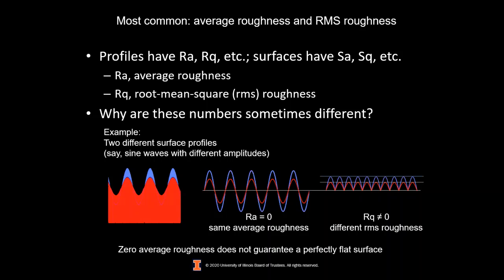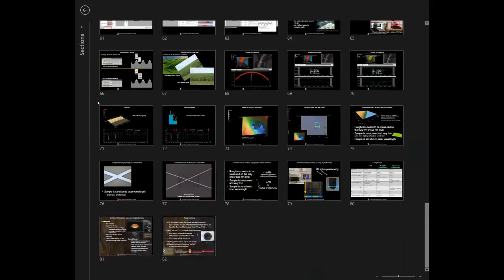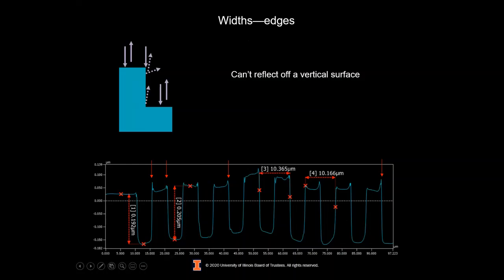Okay. This question seemed interesting and followed along. Is it also possible to measure samples with high aspect ratios, such as a nanowire array or a pillar structure? Yes, as long as you don't care about the sides too much. You can definitely measure the heights, and I'll get back to this image here. You can definitely measure the height between the top surface and the bottom surface, as long as the spacing between the nanowires is larger than the resolution limit.